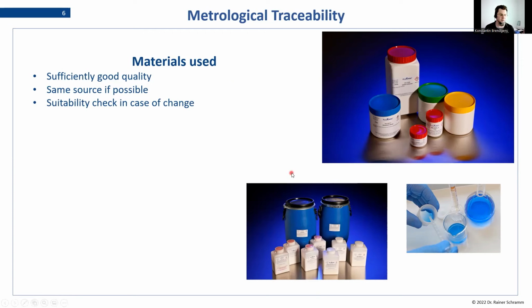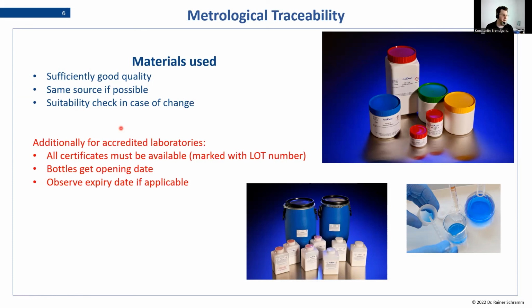So let's say you change the flux because you found a cheaper offer or something like that, and you want to make sure that both of your control samples later will perform. We'll talk a bit more about the details of that in a minute. And basically, if you change something, you want to check if that works.